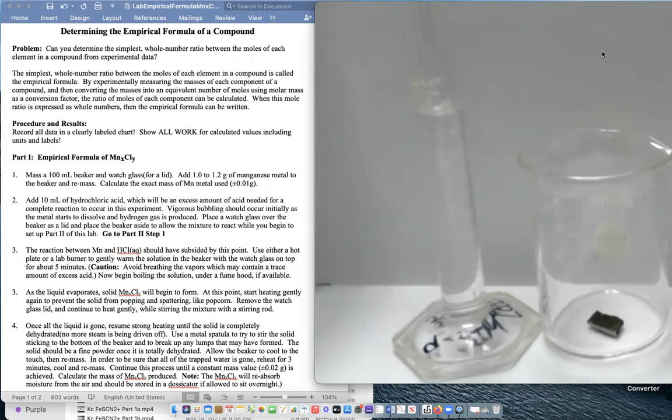In this case, I used a fairly large piece. I didn't break it down to speed up the reaction, since you don't want to be here all day doing this. You can take a pair of pliers and just take that piece of manganese and break it up into smaller pieces by squeezing it and snapping it off. It occurs pretty quickly and pretty easily, but that's going to be your starting experiment that you're going to work with.